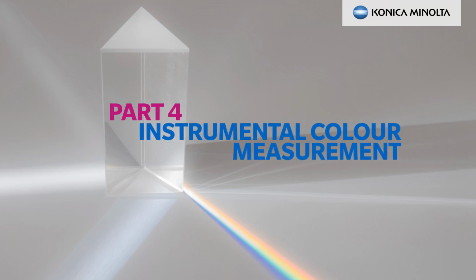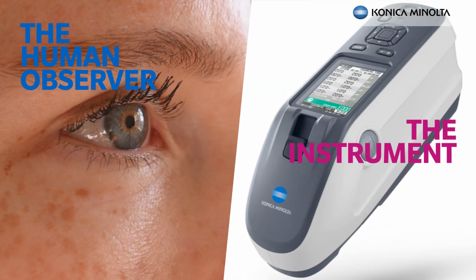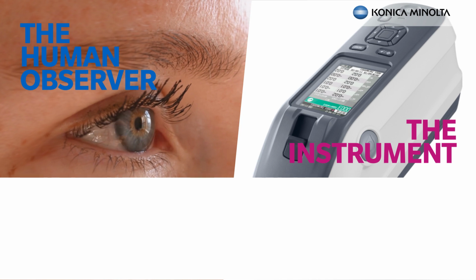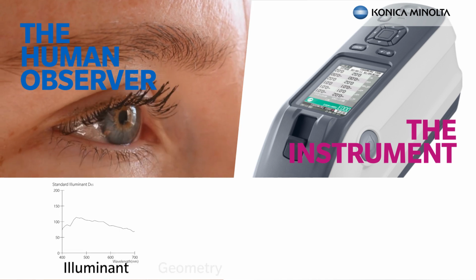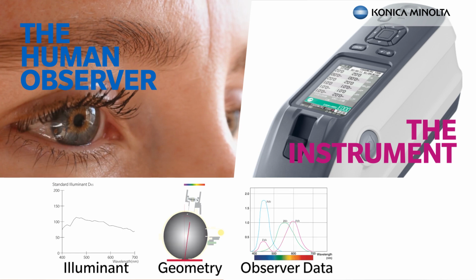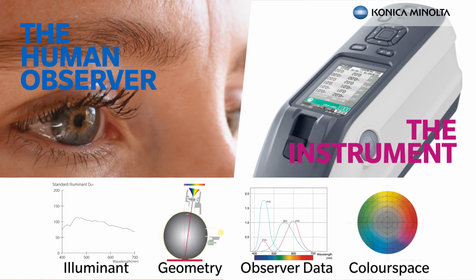Part 4. Instrumental colour measurement. The purpose of colour measurement technology is to give you access to an objective evaluation of colour. Colour measurement instrument will control the illuminant and the observer. Standardisation and traceable calibration makes this data globally consistent.